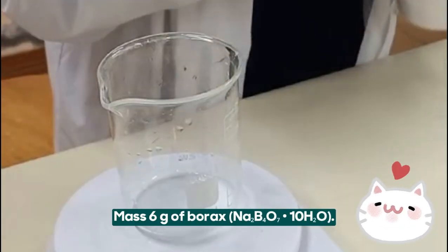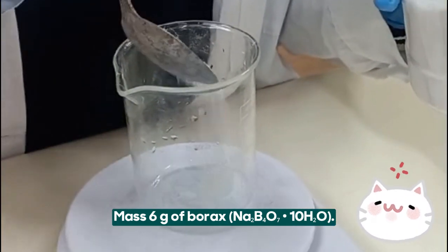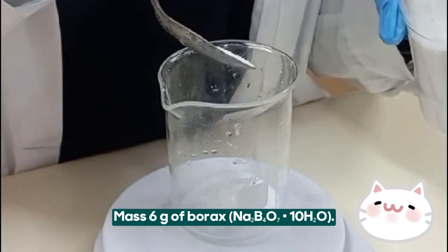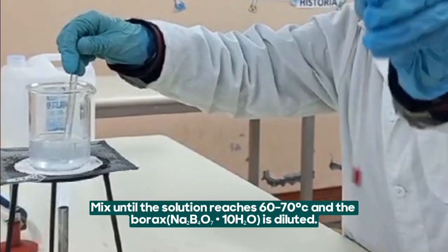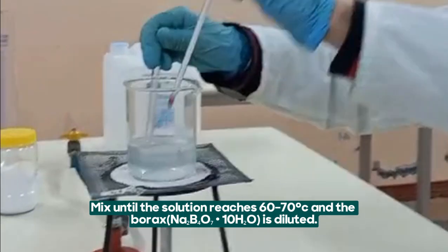Mass 6 grams of borax. Add 100 milliliters of distilled water to the beaker. Mix until the solution reaches between 60 and 70 degrees and the borax is dissolved.